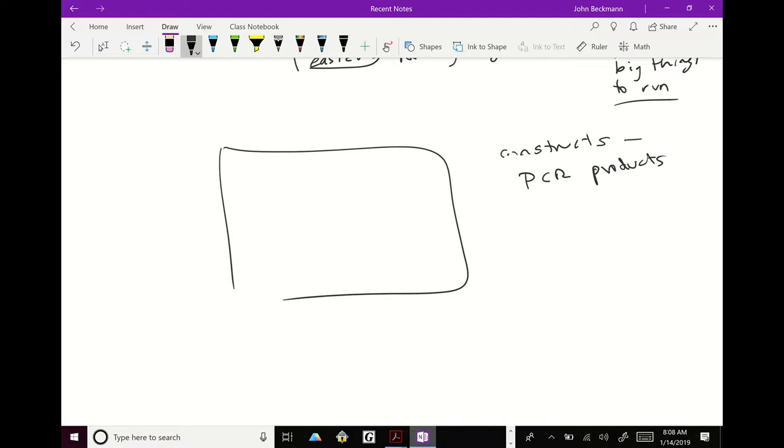Now, here's a problem. How are you able to see the DNA in an agarose gel? Is DNA visible? Can you see it with the naked eye? No. So how do you see the DNA on an agarose gel? Is it dye? Yes, you could call it dye. Do you know what dye? Can I see blue? That's protein. Good though. See, this is where we're starting to see the differences between nucleic acids and proteins. Yes, you'll add a dye, so that is conceptually correct.